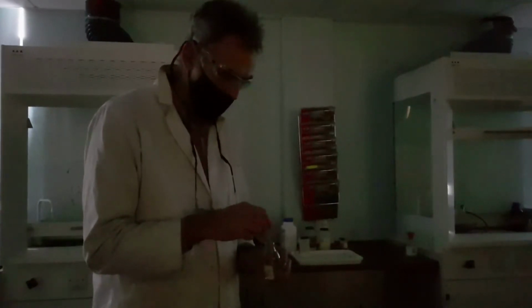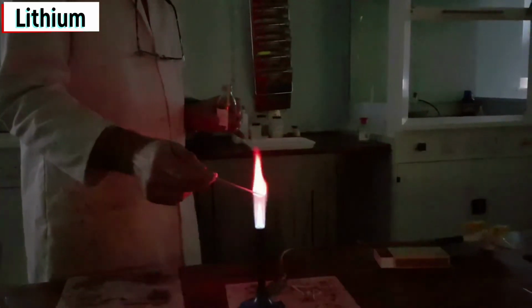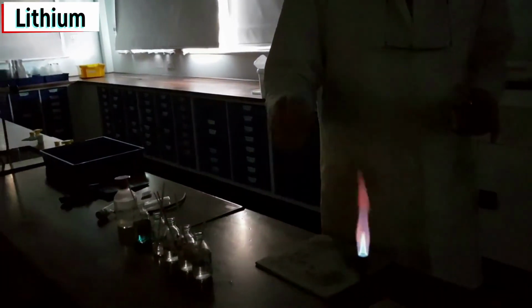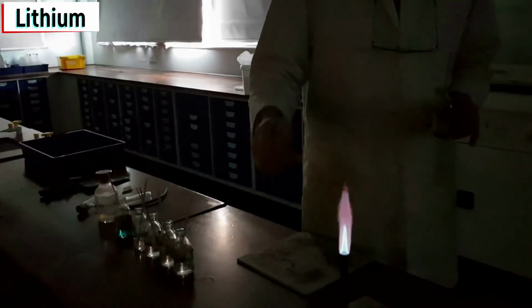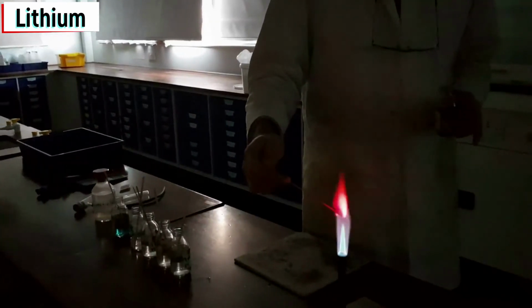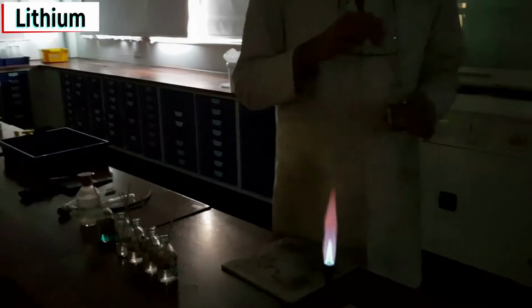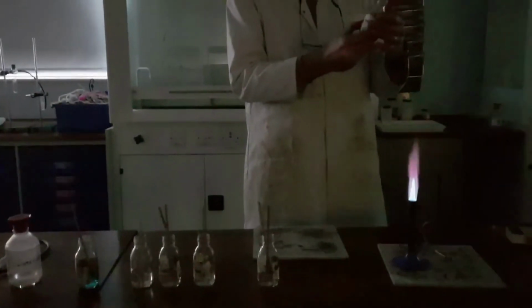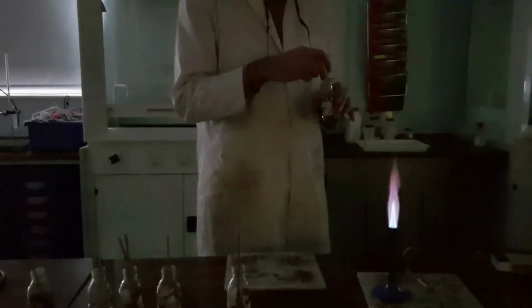And the first one we're going to demonstrate is lithium. Lithium, so the flame colour of lithium. And hopefully you can see there a lovely red colour in the flame. A lovely red, we might even call that crimson. So that's one of the ones you definitely need to know. The lovely red colour of lithium.